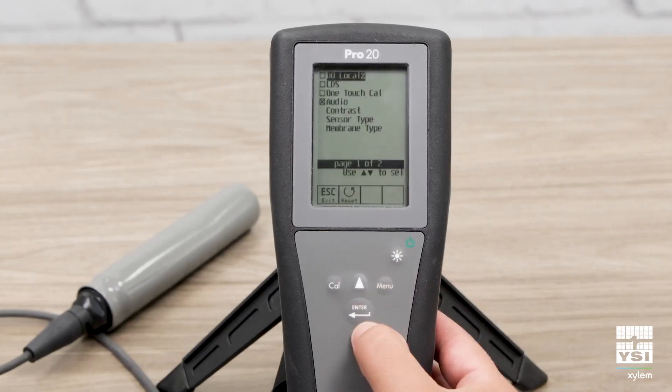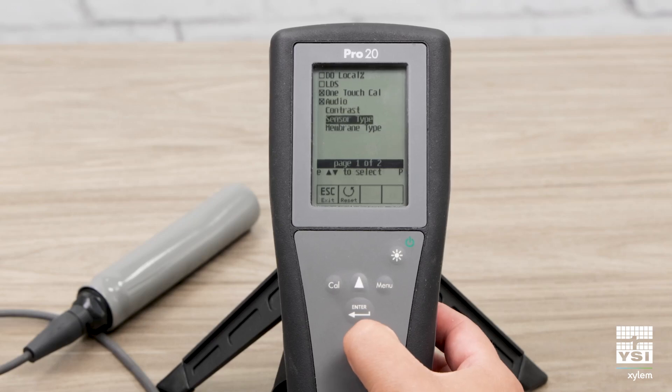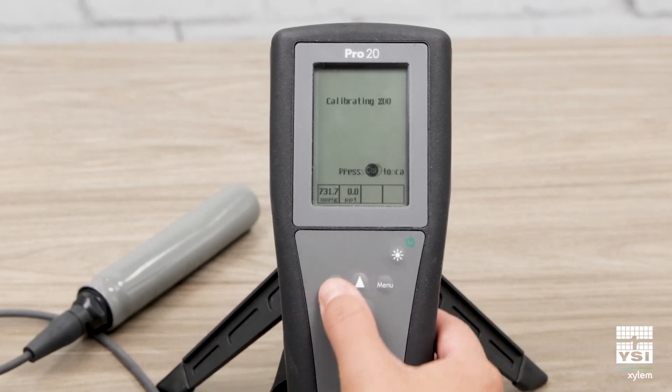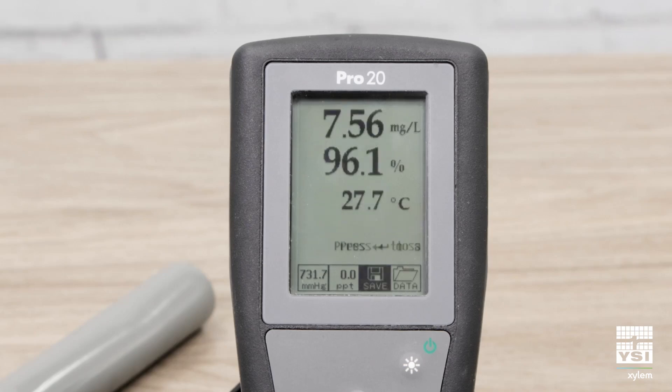Enable one-touch cal in the system setup menu. Press and hold the one-touch cal key for 3 seconds. You'll see calibration successful on the screen. Your sensor is now ready to use in the field.